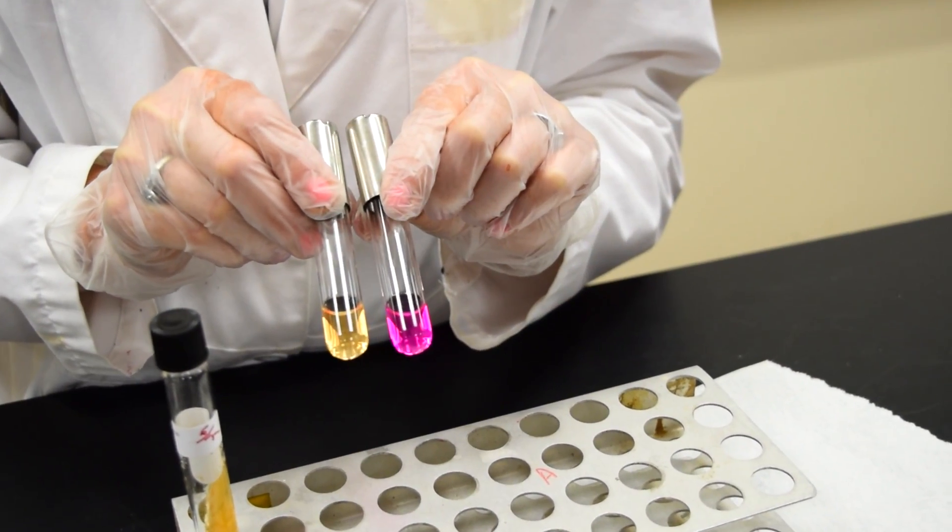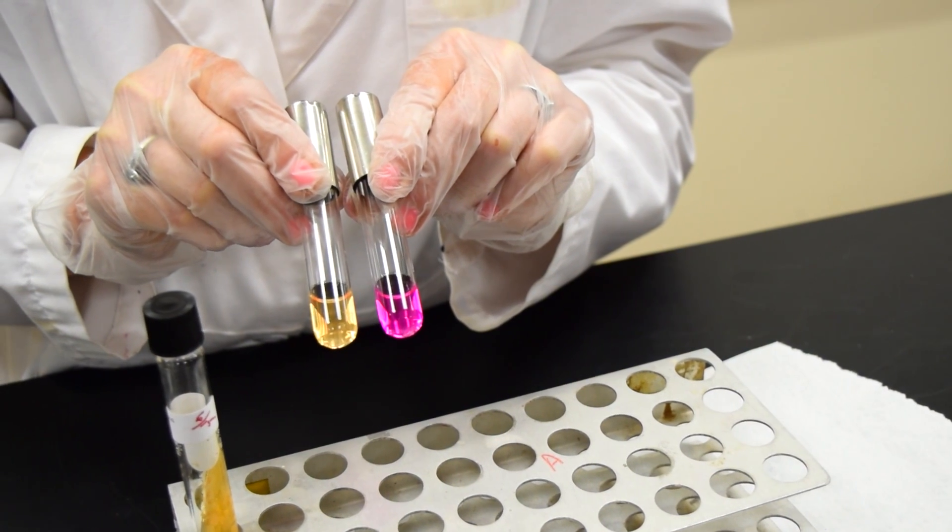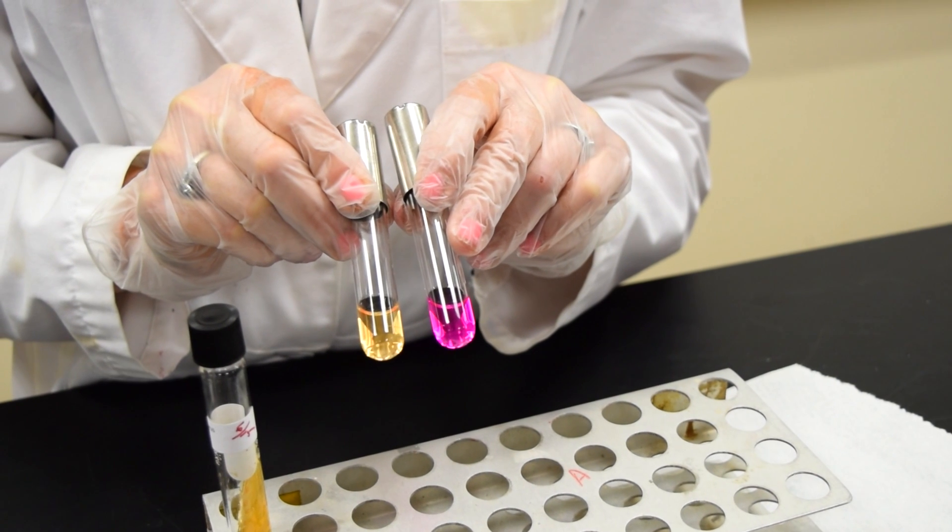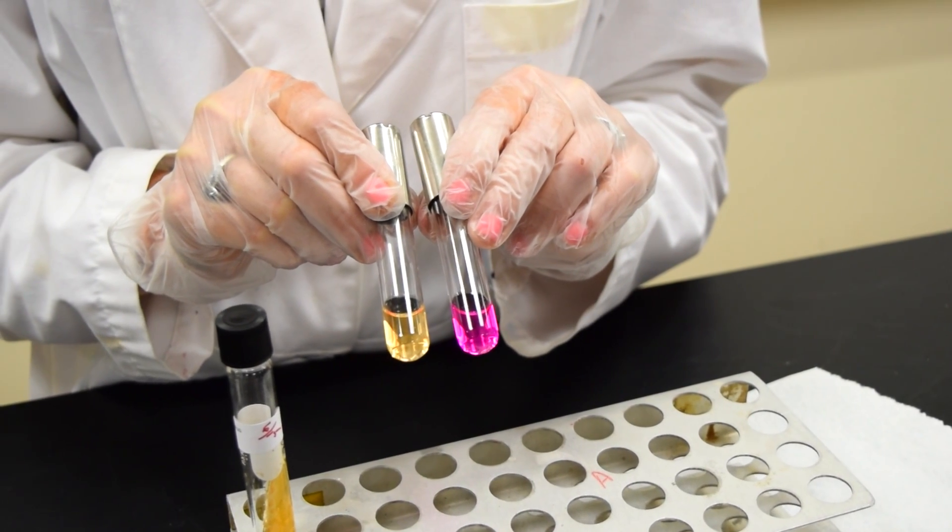At the next class period, you'd like to take a look at this tube. A tube that has turned a bright pink magenta color is considered positive for the enzyme urease.